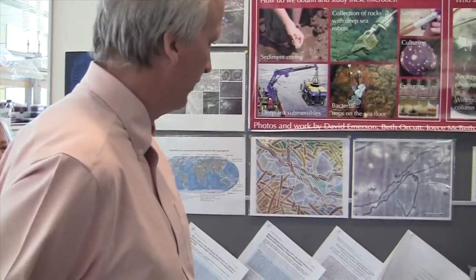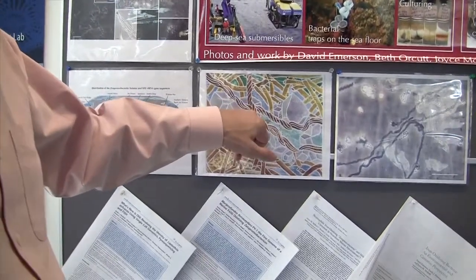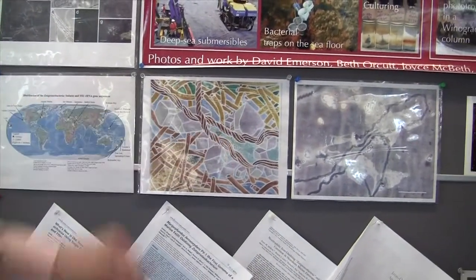And so we have various basic science interests, and the corrosion is more of an applied area. We're also interested in these iron oxides, which are very reactive with lots of other organisms and organic material, other metals. They're very good filters, and they're nanostructures. This is about a micron in diameter, and it's actually made up of these little threads, which are about 50 nanometers in size.